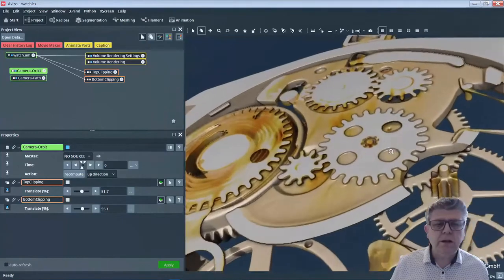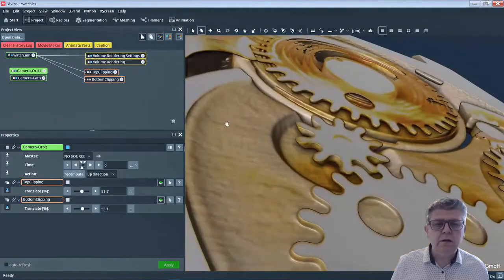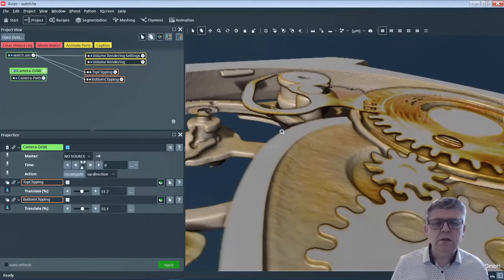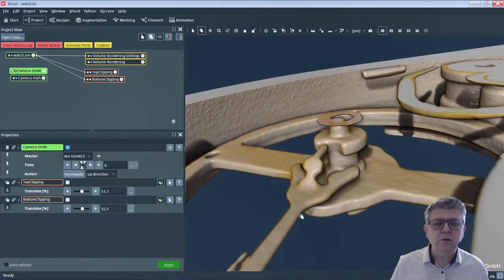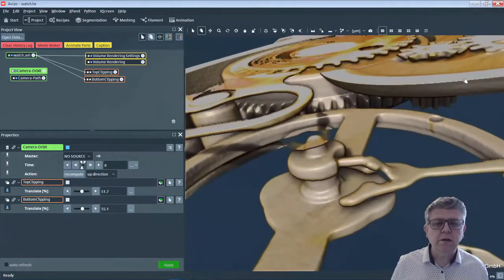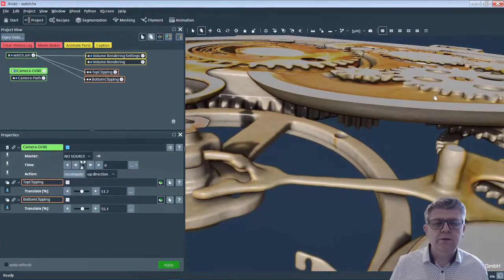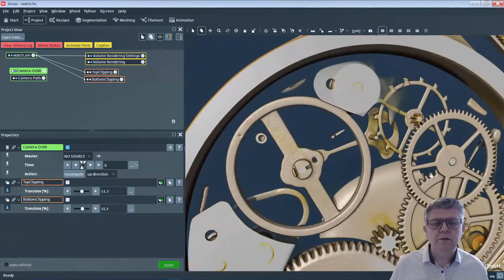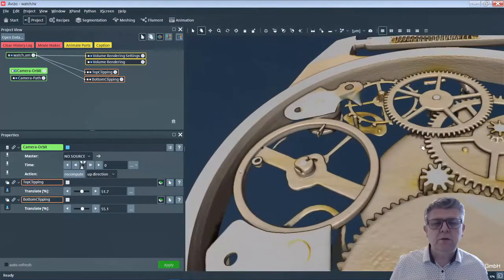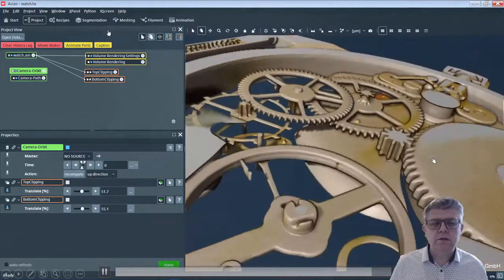You still see a flickering between the moving and the steady visual, and this is done on purpose to give you a better animation movement. So when you move the camera, the quality is a little bit degraded on purpose to have a faster frame per second camera movement. But then when you stop, the quality is correct. So let's move on.